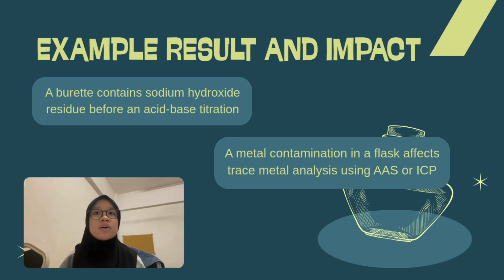Similarly, in trace metal ion analysis, residual metal ions left on glassware can contaminate the sample and also produce wrong results. These examples show that clean glassware is very essential for obtaining accurate, precise, and reproducible analytical data. Proper cleaning is therefore an important part of quality assurance in every laboratory.